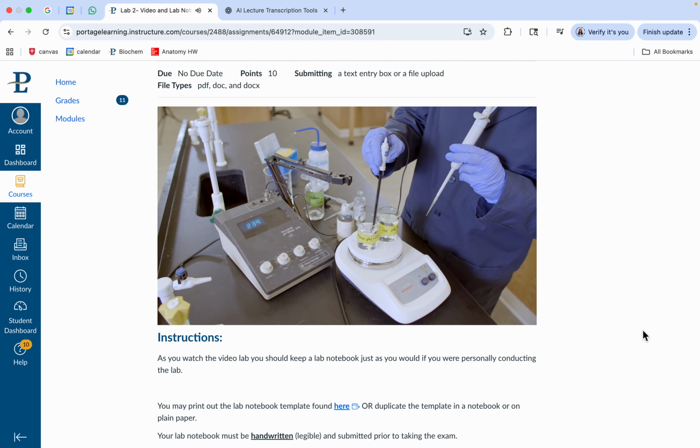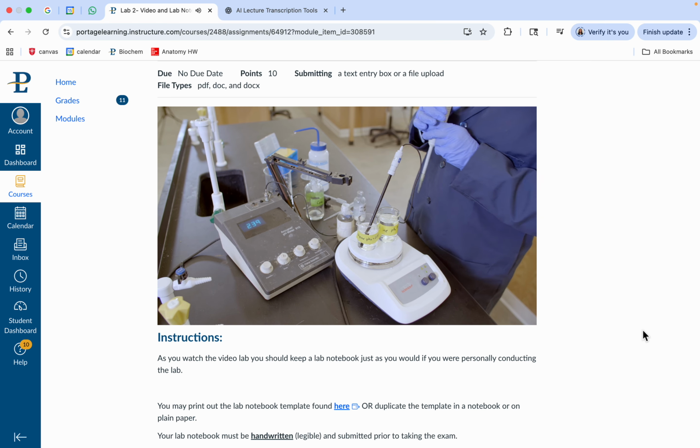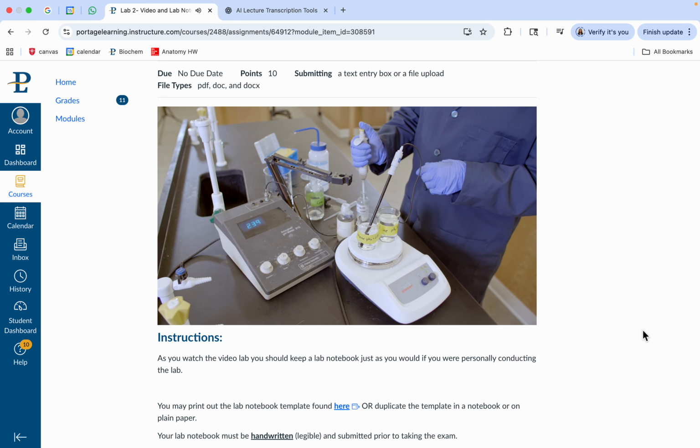So we're going to put that in and mix it. We're adding a little bit of base, and notice, as we would expect, the pH starts to go up just a little bit. It went from 2.38 to 2.39, so not much, again showing its ability to act as a buffer.